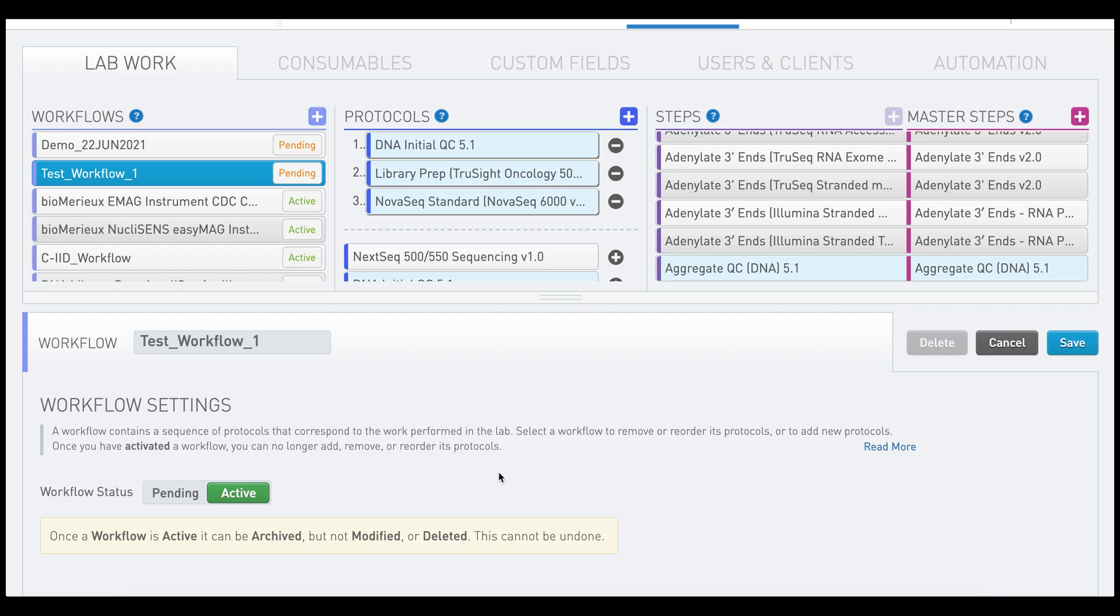This is a warning just to be sure that you are done with development. You also want to confirm the workflow name because once you click Save, the workflow name will be locked down and it cannot be changed, along with the order of the protocols in the workflow.